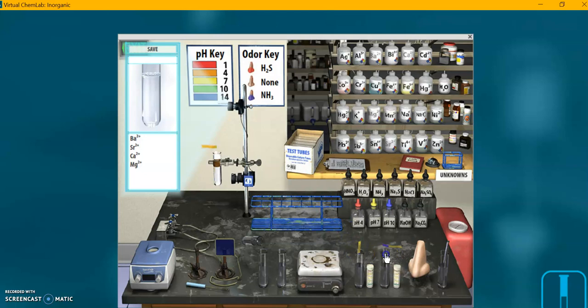pH vapor, so pH paper held over the mouth of the test tube to see what pH the vapor has. A nose for sniffing. Up here we've got an odor key, so you can see that.